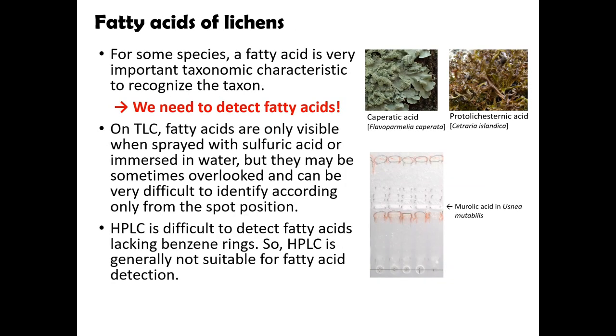For some species, a fatty acid is a very important taxonomic characteristic to recognize the taxon. For example, Flavoparmelia caperata contains caperatic acid, and Cetraria islandica contains protolichesterinic acid. So, we need to detect fatty acids anyway.